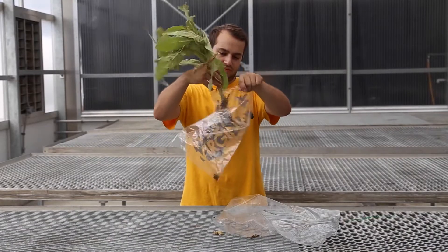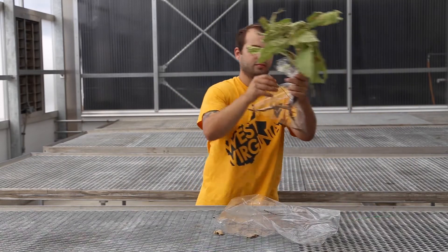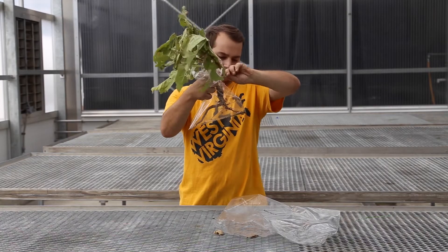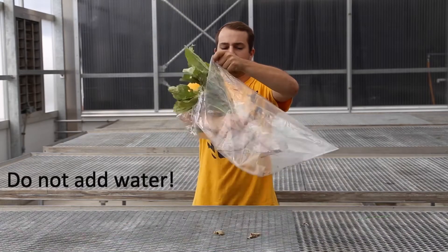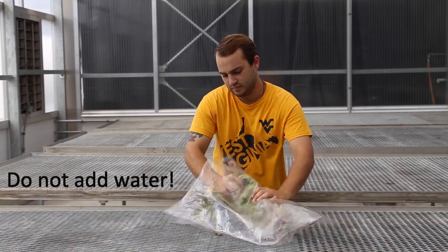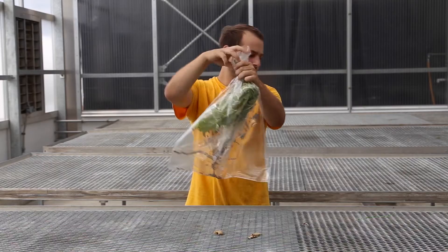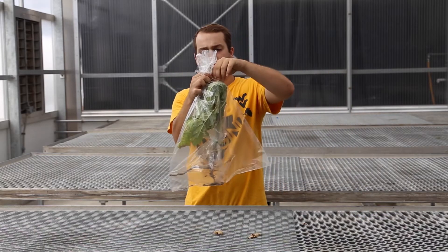Roots and soil should be bagged and secured separately from the plant itself. Once secured, place the entire plant in a second plastic bag. This will keep it from drying out, while also trapping any insects that may be on the plant. Do not add water or wet paper to the sample, as it is unnecessary and can complicate the diagnostic process. If any loose stems or foliage were collected, place them in a separate bag.